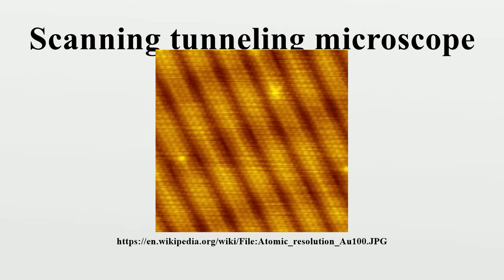Other STM methods involve manipulating the tip in order to change the topography of the sample. This is attractive for several reasons. Firstly, the STM has an atomically precise positioning system which allows very accurate atomic scale manipulation. Furthermore, after the surface is modified by the tip, it is a simple matter to then image with the same tip, without changing the instrument.